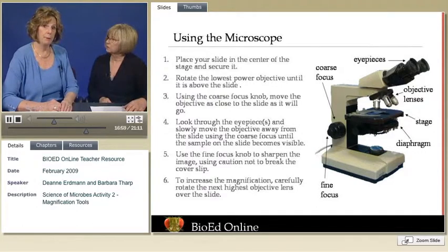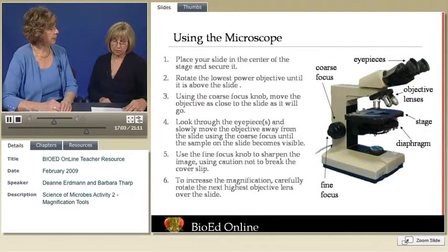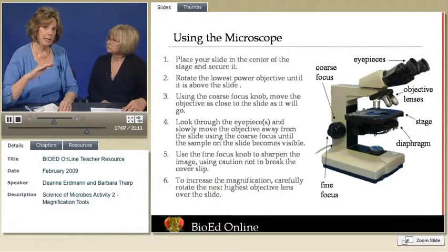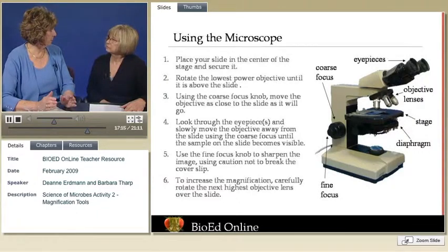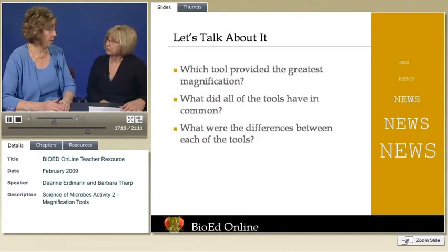But many microscopes that you have in the classroom may only go up to 200. Okay. So in this particular case, you're looking at something that's thin. You're going to be able to easily pass light through it. So I think you can go as high as you want. You're not going to see that whole letter E anymore, and I think that's an important thing for students to talk about, that they couldn't see the whole thing as they got. Not even one letter. No, not even one whole letter.